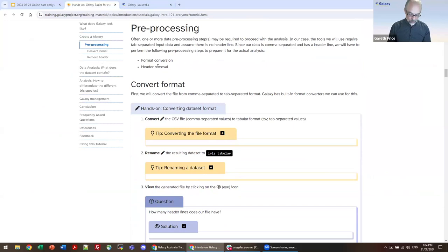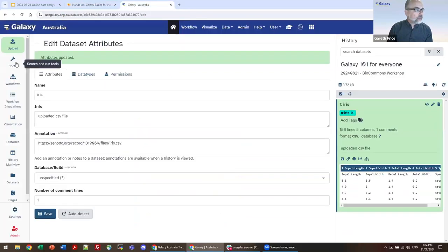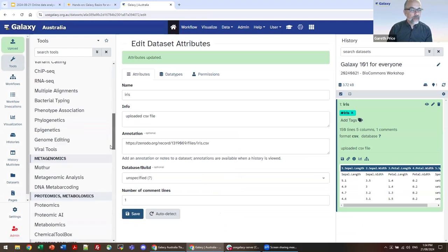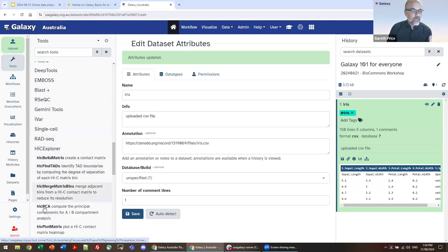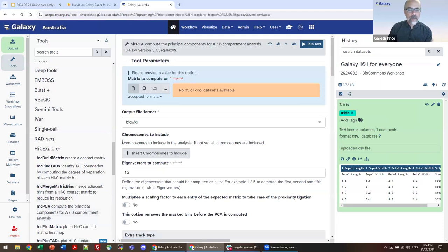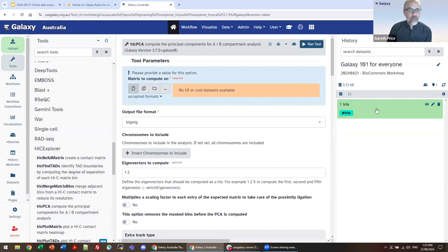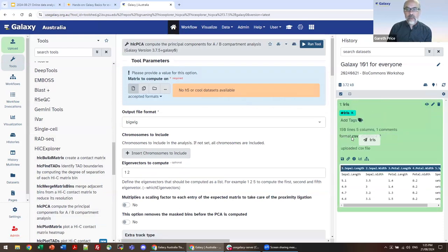For every tool that exists in Galaxy — and we have just shy of 2,000 tools on Galaxy Australia at the moment — every single one will be expecting a particular data set type to be available. If I click on principal component analysis, for example, it says it needs a matrix file and it cannot find a matrix file in my history. So you do need to be aware that when running a tool, you obviously need the right data. The activity we're going to do now is convert the format from CSV into a tabular file, which the downstream tools can access.